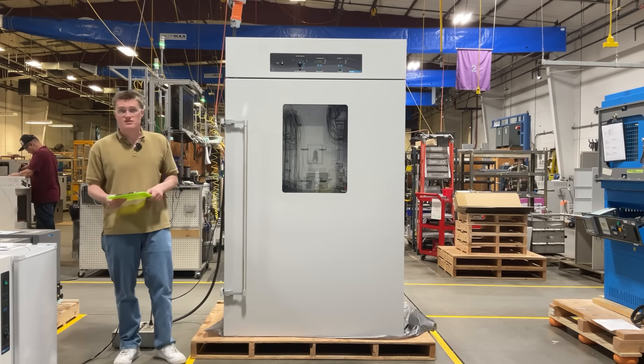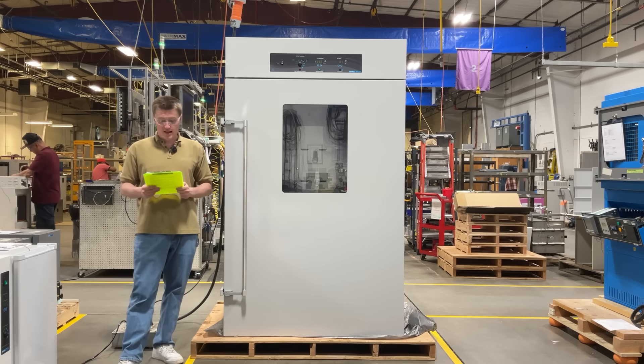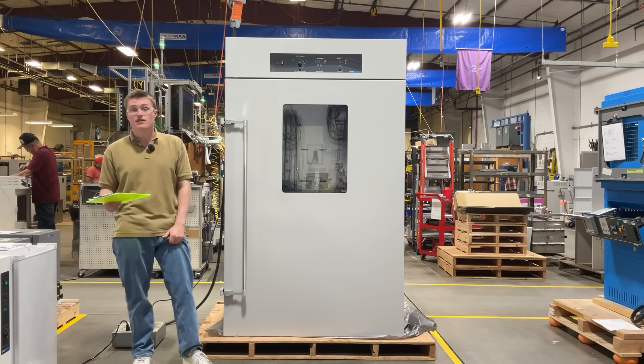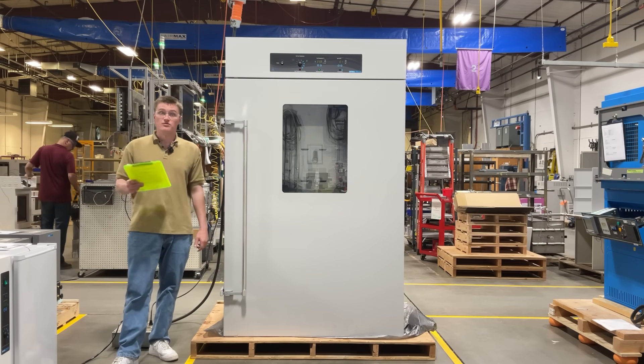Shell Labs' large-capacity 58 cubic foot CO2 dry incubator is designed for long-lasting reliability, minimal maintenance, and superior contamination control, making it a top choice for biotech, pharmaceutical, and clinical applications. Invest in precision. Invest in reliability. Invest in the FCO 58.